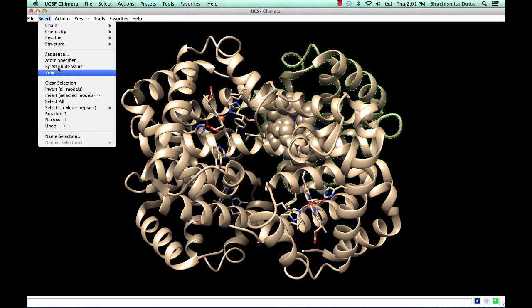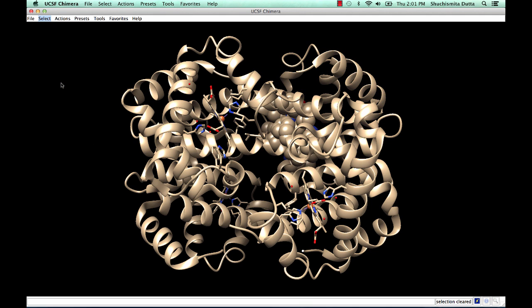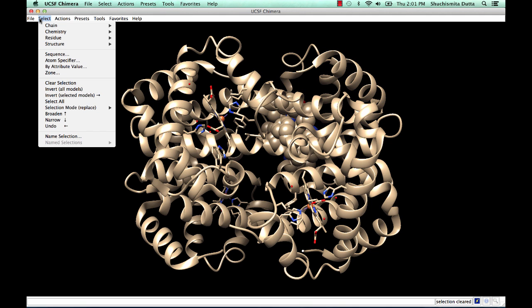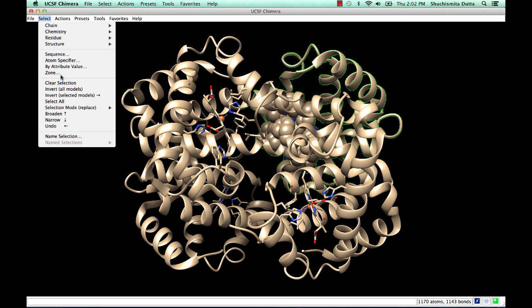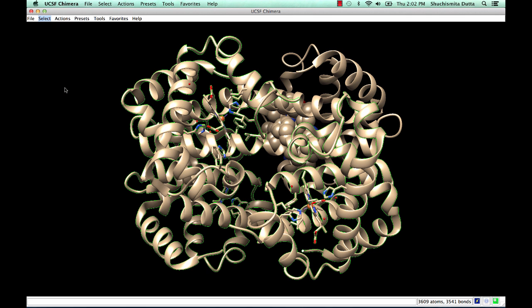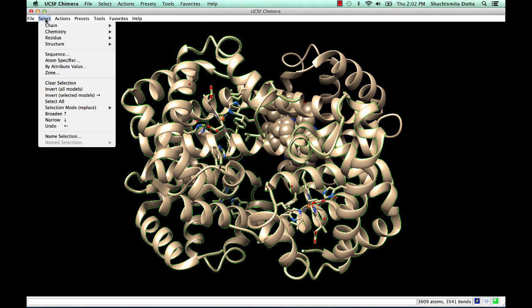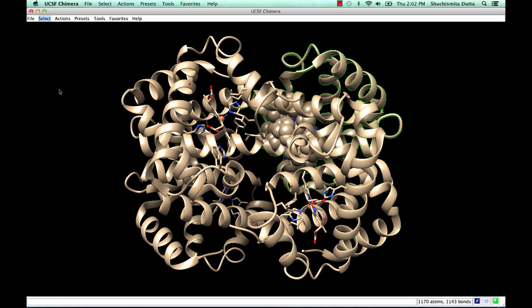One can clear selections using the Select menu option or select chain A and invert the selection, so everything other than chain A is selected and inverted back.